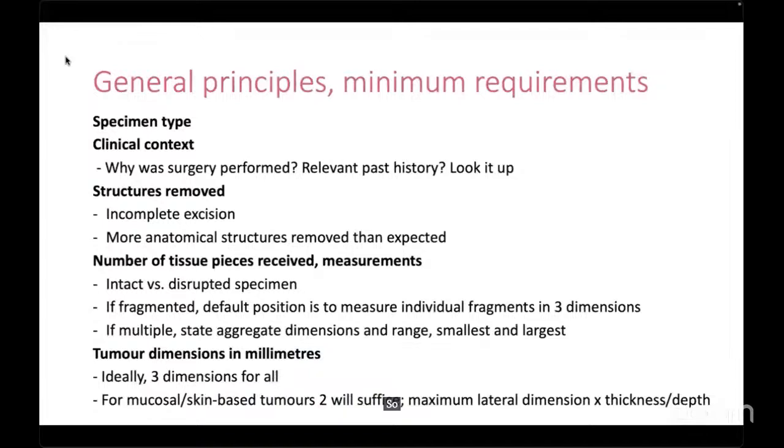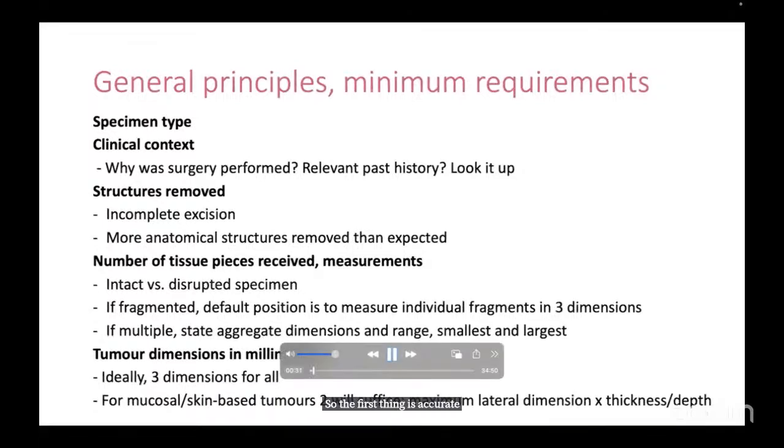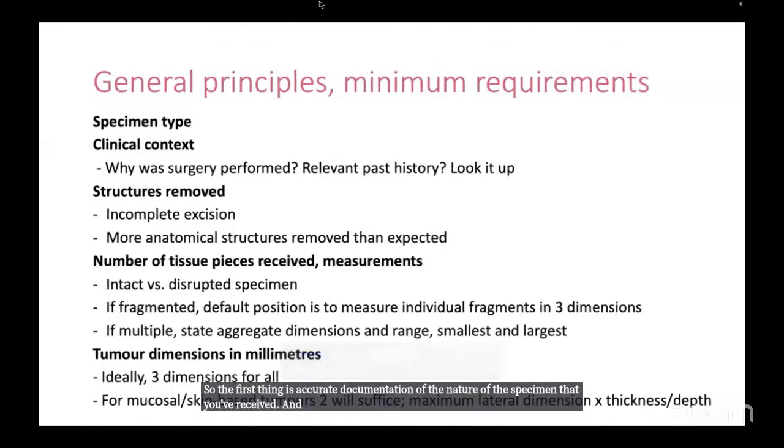So the first thing is accurate documentation of the nature of the specimen that you've received. And this is particularly relevant to cervix, vulva and hysterectomy, where there are a number of different surgical excision types.